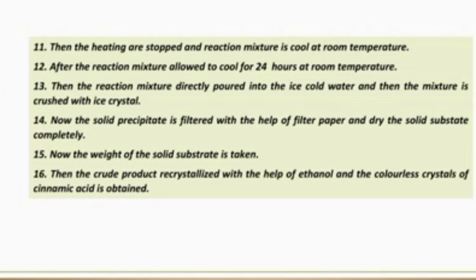Step 14 — the solid precipitate is filtered with the help of filter paper and the solid substrate is dried completely. Step 15 — the weight of the solid substrate is taken. Step 16 — then the crude product is recrystallized with the help of ethanol, and colorless crystals of cinnamic acid are obtained.